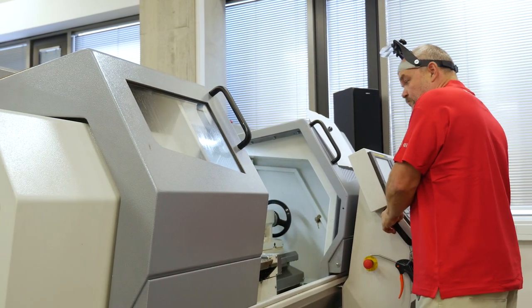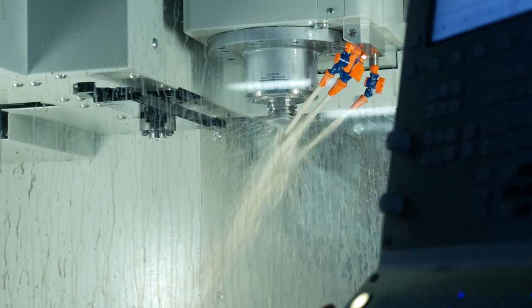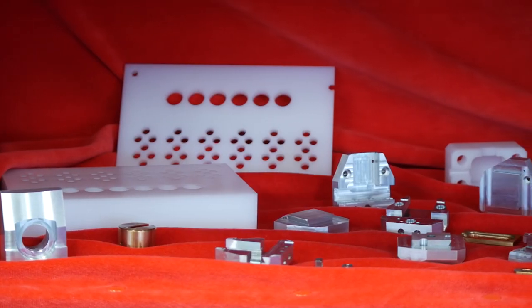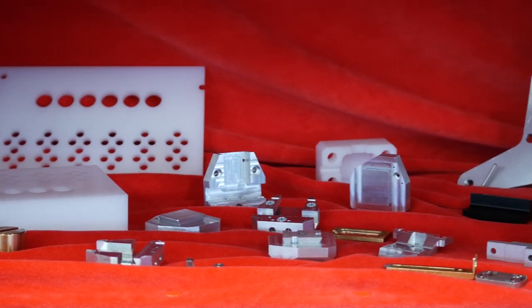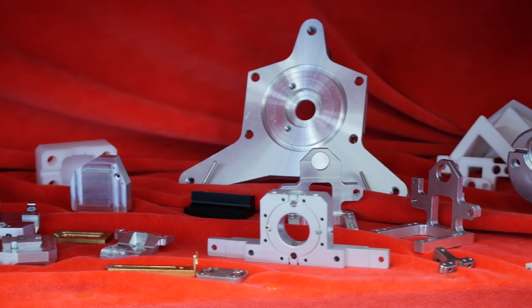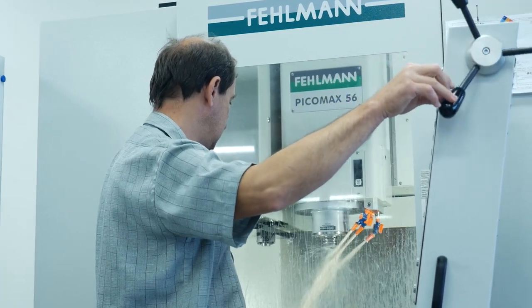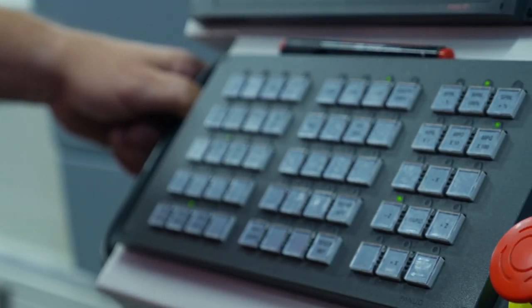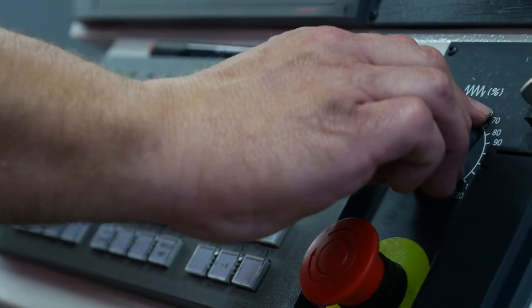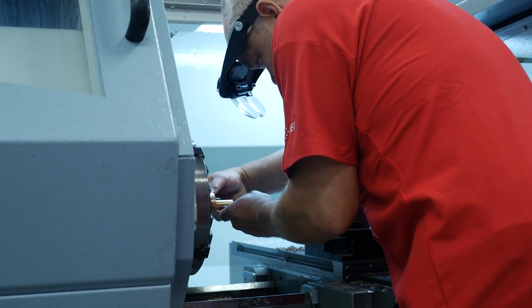Are all the parts made by FEI? A part of the prototypes are produced directly in the FEI machinery workshop. Various materials are machined there, from construction steel and special non-magnetic materials to aluminum and titanium alloys and technical plastics, whose properties in certain parameters are better than that of metals. The size of samples and the precision of the machining range is to a hundredth or even a thousandth of a millimeter and comply with the precision of the final system.